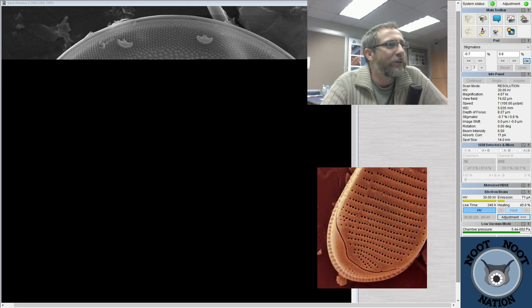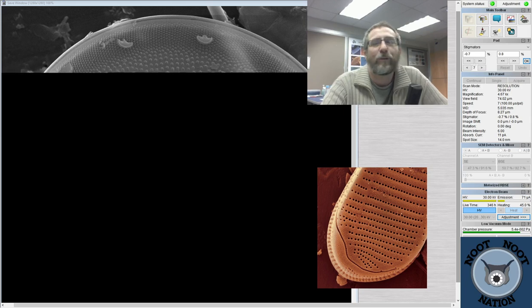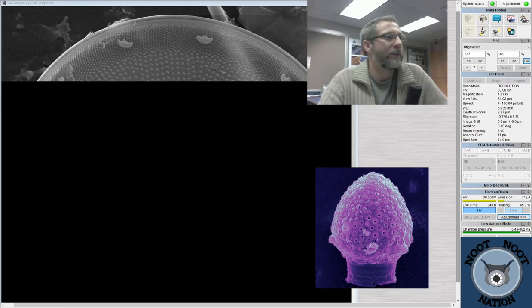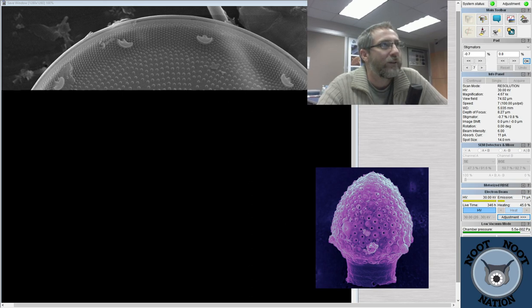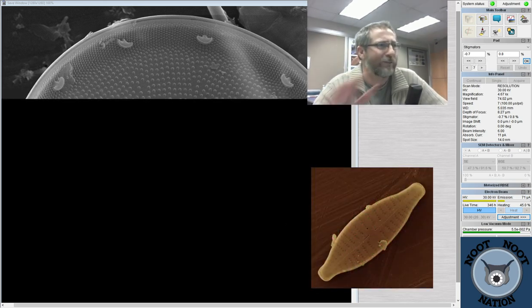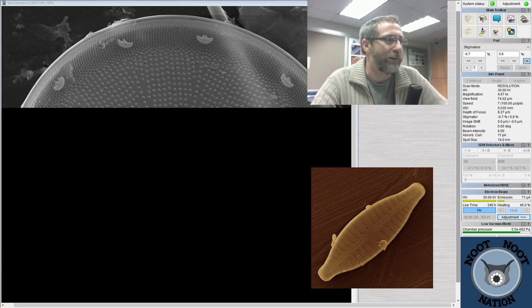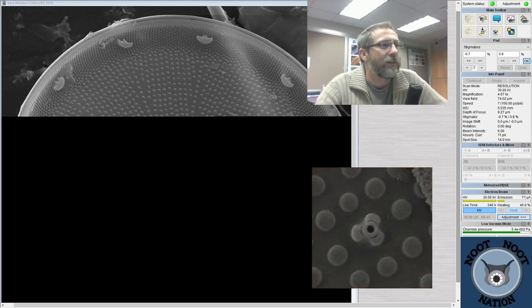Is it possible to see whole diatoms as the stuff inside a hand warmer material in a light microscope? Oh, you mean like if you broke one open? Yeah, you probably could. I've never done that, actually. I know that they put diatoms in it because I looked at the description. If you look at the ingredients or whatever, I know you're not eating it, so it's not an ingredient, but they have to tell you what things are made out of. It will say diatomaceous earth on it.